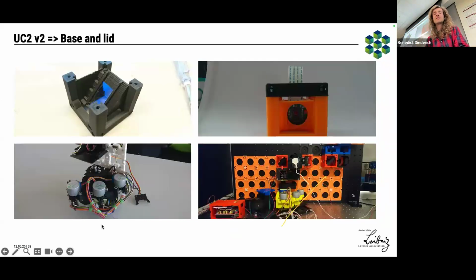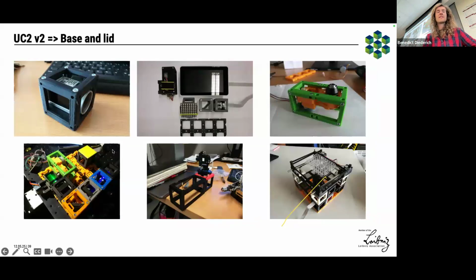We continued. There was the next version, number 2 maybe, I don't know, which was also a bit more compatible with Thorlabs components. That was the first device that we put into an incubator, where we merged the Open Flexure, which is also a very cool open source tool, with our stuff. So we made it kind of compatible, because that's also nice. If you're open source, you can just mix and match everything you want. I think that was also almost the time where we started writing the manuscript.